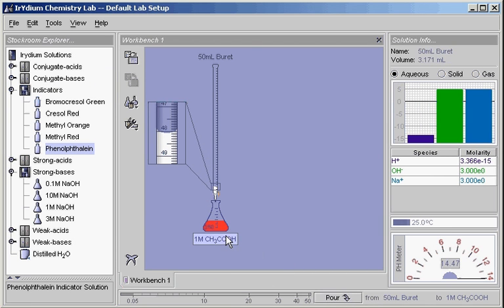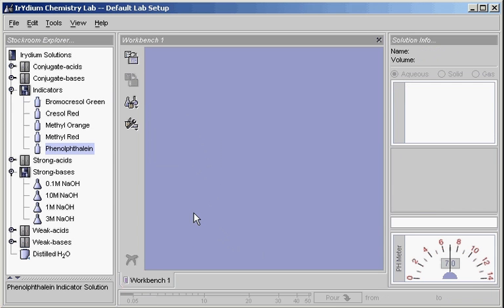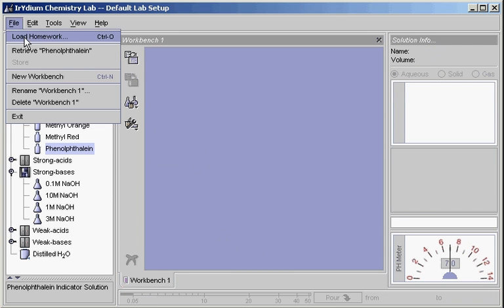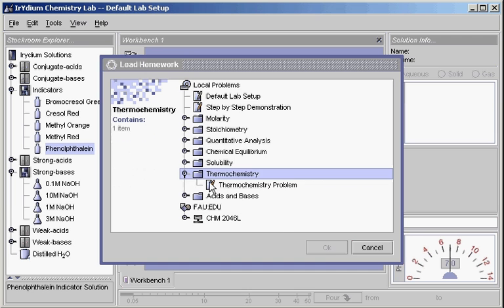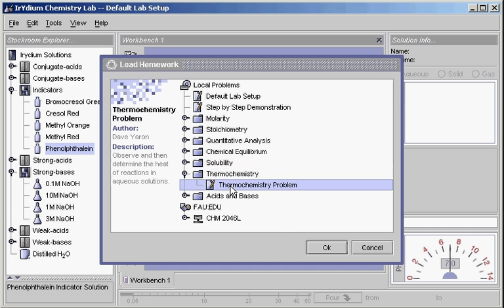If you are doing the virtual lab assignment as part of regular classroom homework, there is an option of loading the homework problem into the lab. To view a problem, go to load homework from the file menu. This is the homework repository. Select a problem title and click OK to load it.